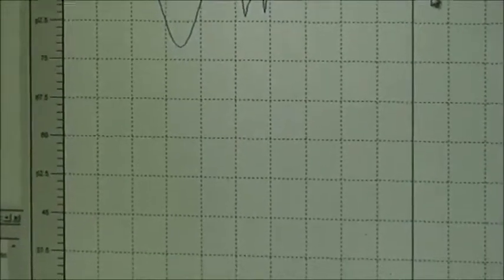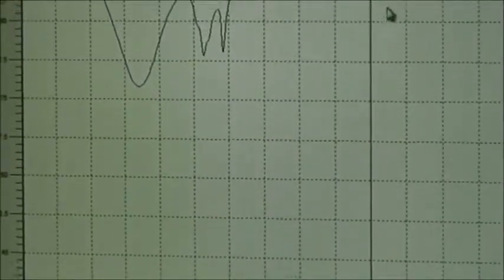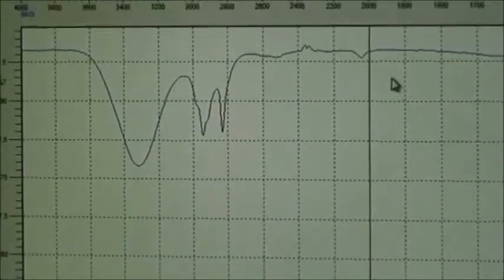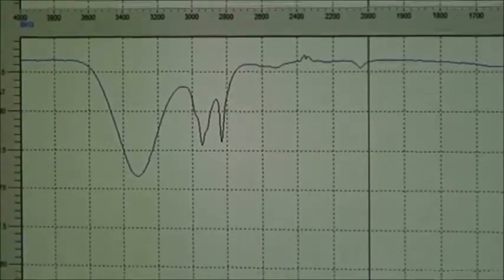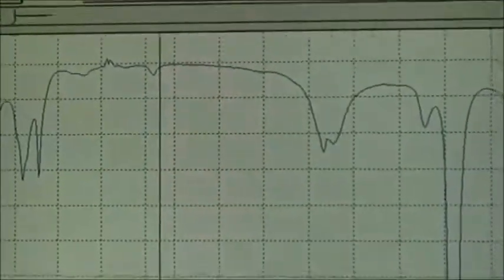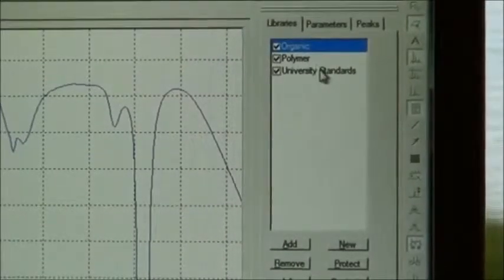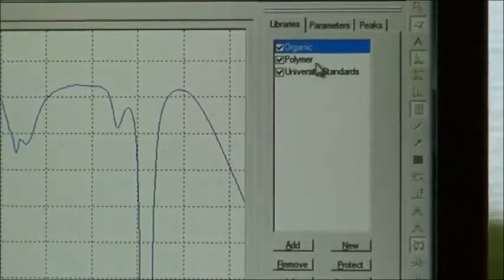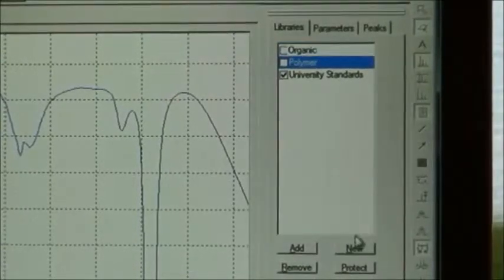I can click right here the search box. And if you look over here to the right, you can search for libraries in organic libraries, polymer, and university standards. So I'm going to check my library for university standards.